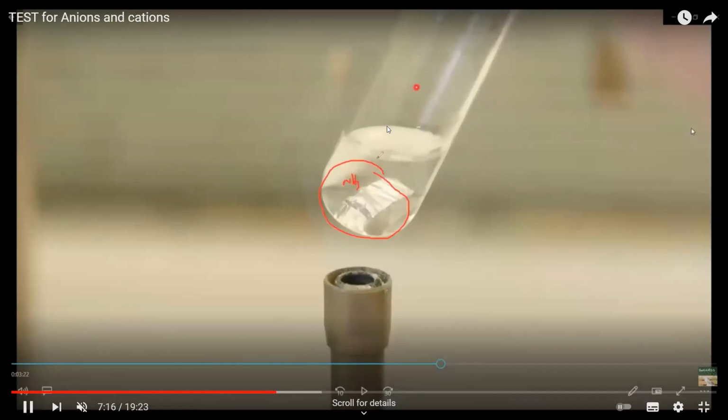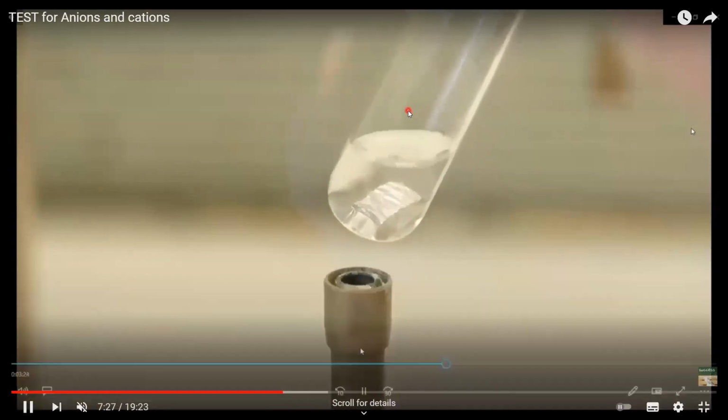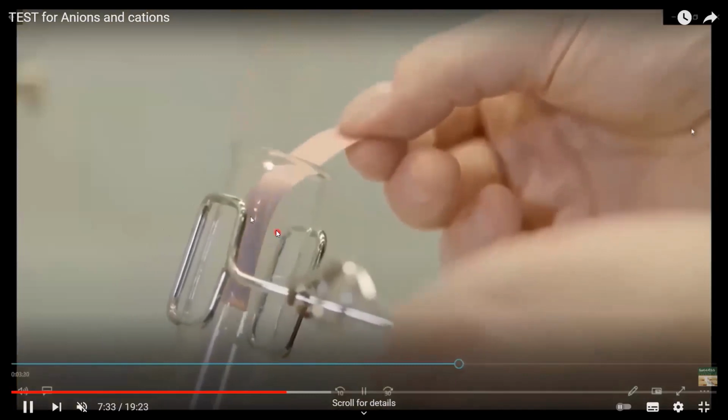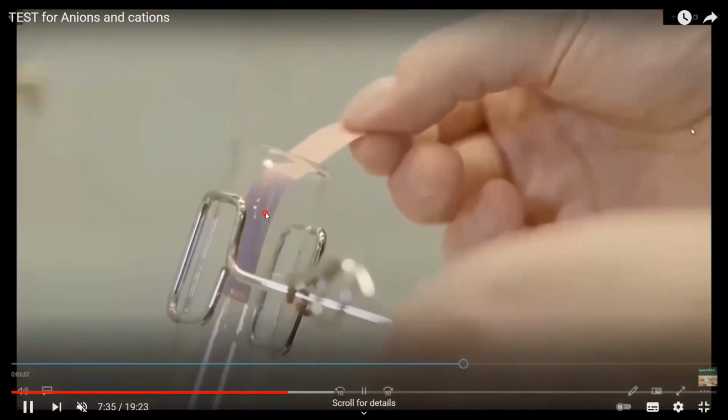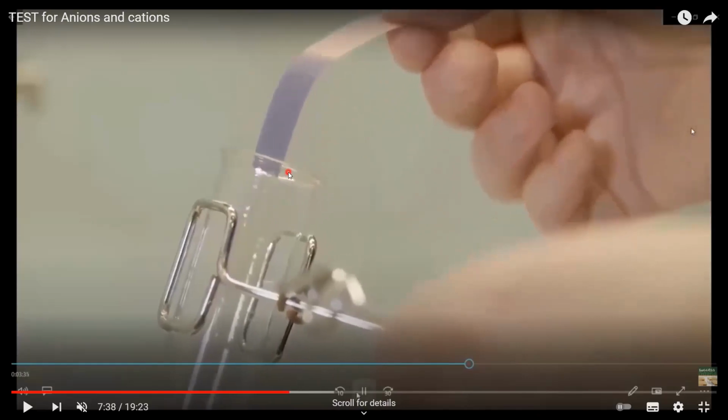As this ammonia gas is released, it will turn damp red litmus paper blue. So this confirmed the presence of ammonia gas. So this was a test for a negative ion, the nitrate ion.